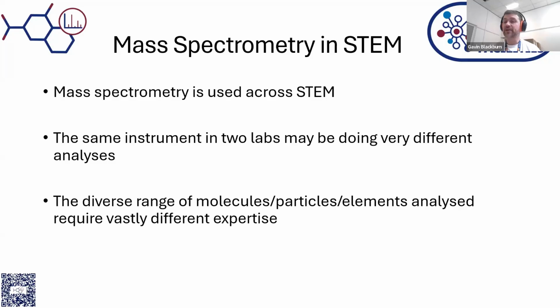So there's this technique called CDMS, which is a charge-based looking at these kind of large virus envelopes so you can get accurate mass identifications for what these are. So you're even looking at large particles, not just simple molecules. And you can get down to elements as well. ICP-MS, which is an inductively coupled plasma source to a mass spectrometer, can ablate things and can start looking for kind of rare elements.